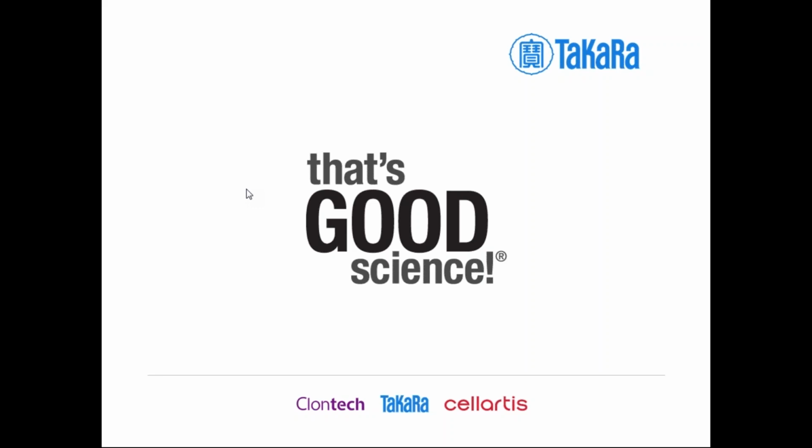I recently saw a paper in which the authors delivered recombinant Cas9 to plant protoplasts, I think from Arabidopsis and rice. We have not validated our recombinant Cas9 for this purpose, but I saw this publication, so I think technically electroporation or, I think, PEG transfection of recombinant protein can be possible.